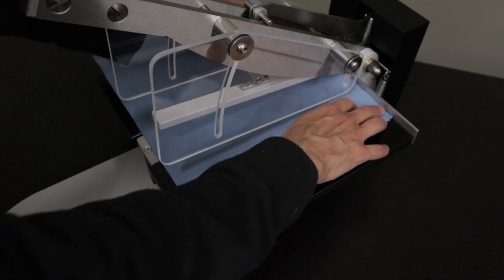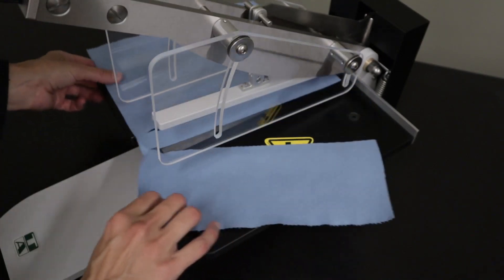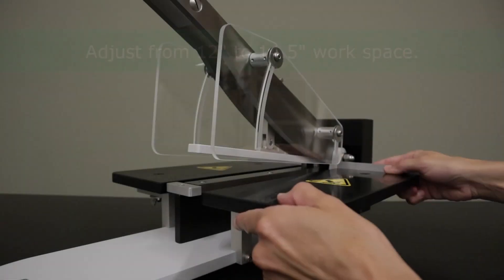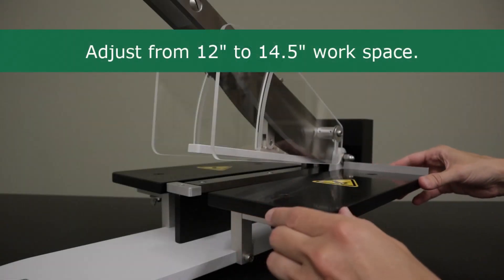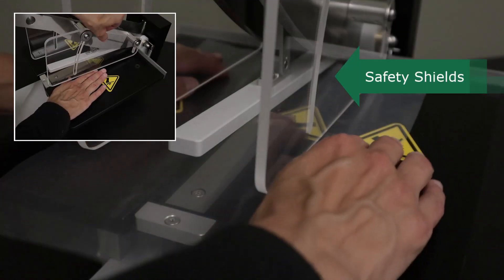Adjustable sample platforms assist with support and alignment of your materials. The platforms provide a 12 to 14 and a half inch work surface. Safety shields are also available to protect the user.